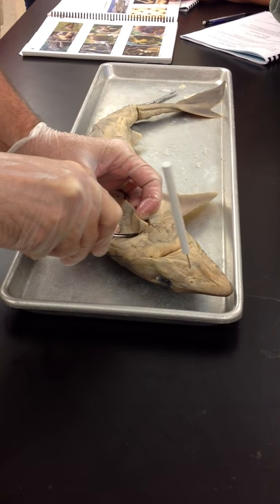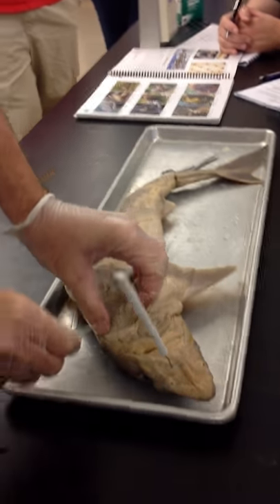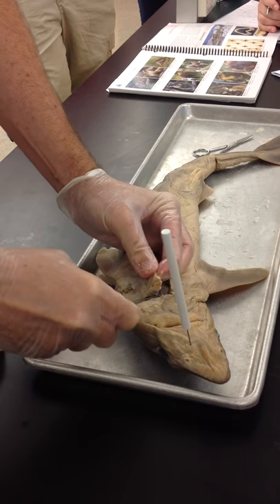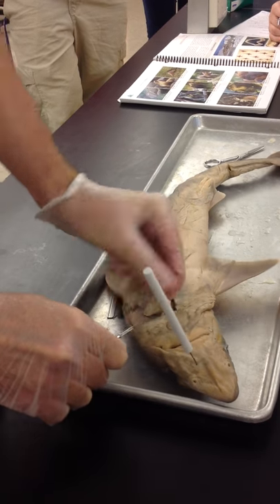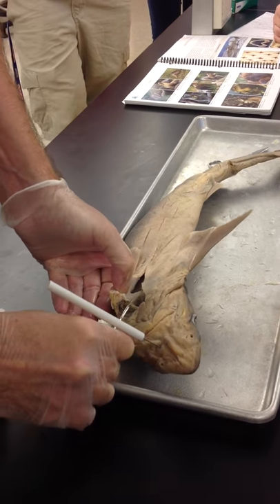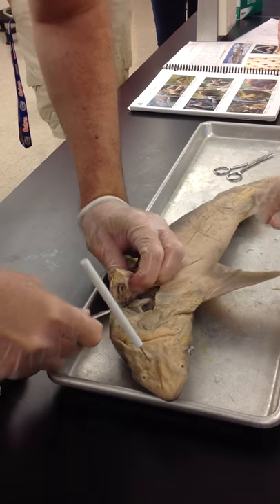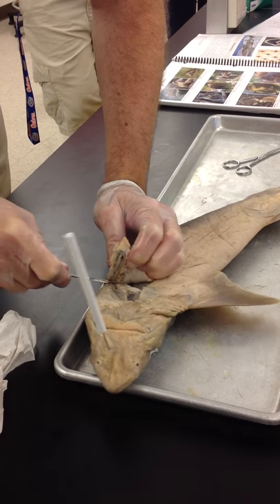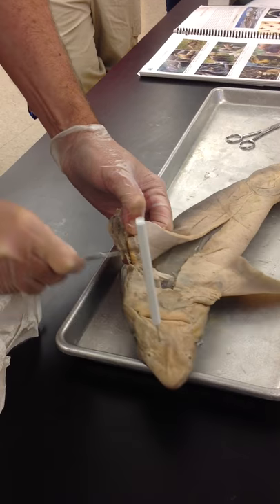Sometimes whenever you catch sharks, they excrete a really smelly, kind of oily substance. What we're going to try to do here is just remove this whole side of his body. Once we get through the cartilage of the gills, it becomes a lot easier.